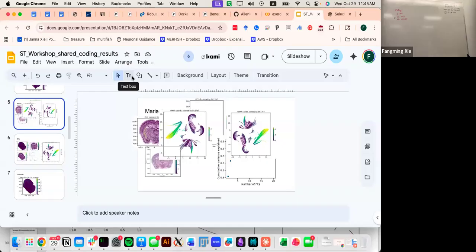Sweet. Because it doesn't like me selecting things this way, that's a peculiar thing. If I do this, it'll run through in a second. As features is a table, it's not exactly a matrix. If I do dot values, it will turn it into a matrix, and you can select it this way. Anyway, that's a detail you can learn from. I just wanted to use a small table to run this through in 0 seconds. Then just see the shape.